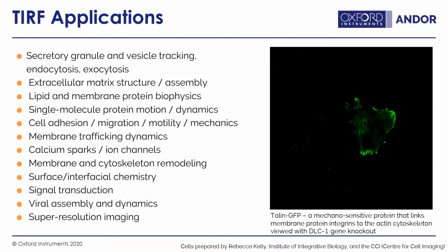We can look at calcium sparks and ion channels, membrane and cytoskeleton remodeling, surface or interfacial chemistry, signal transduction, viral assembly and dynamics, and even super-resolution imaging.